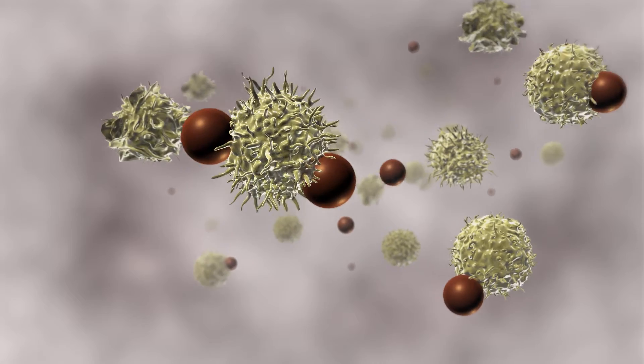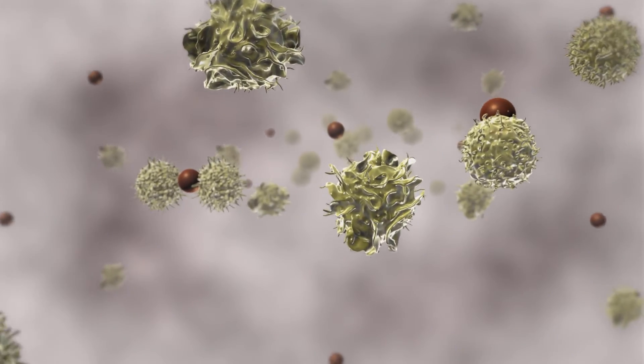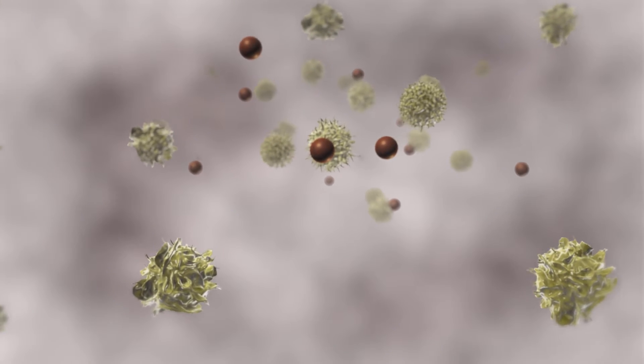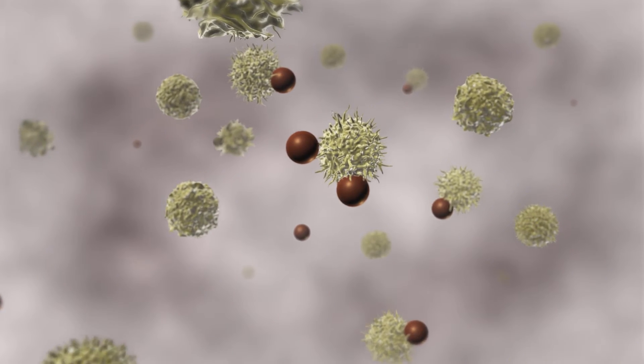CTS DynaBeads CD3, CD28 specifically bind T cells that express CD3 and CD28 on the cell surface. Cells that do not express these markers will remain unbound in solution.